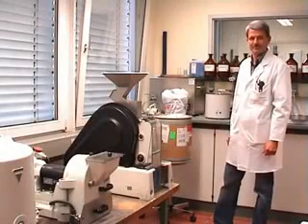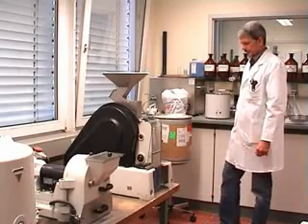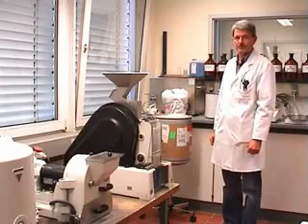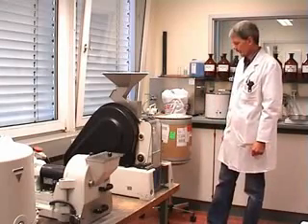Hello ladies and gentlemen. Today we want to show you the performance of our laboratory jaw crusher Pulver Z1. The Pulver Z1 is a jaw crusher for sample preparation of large samples.